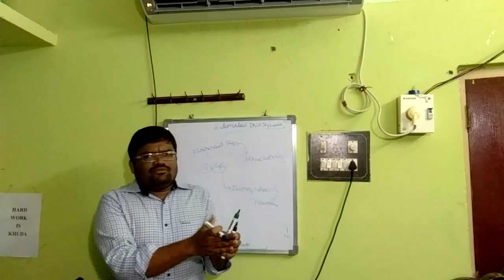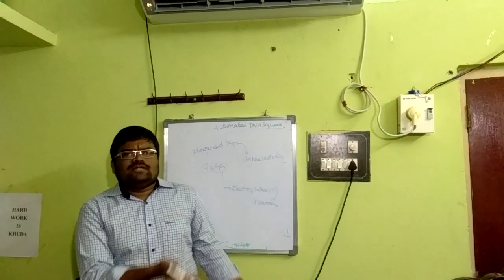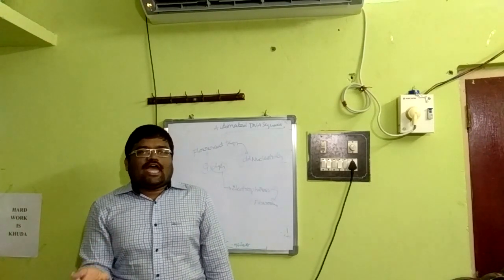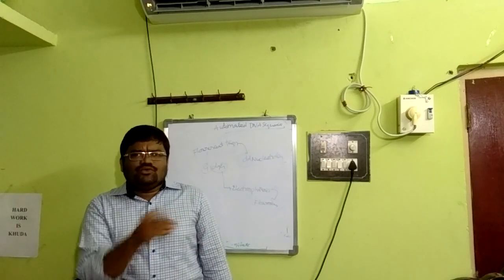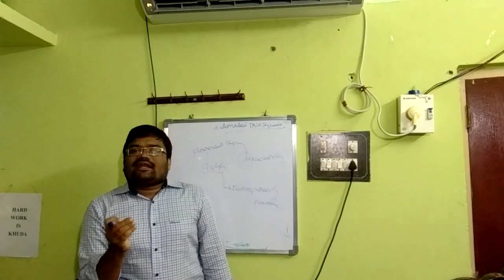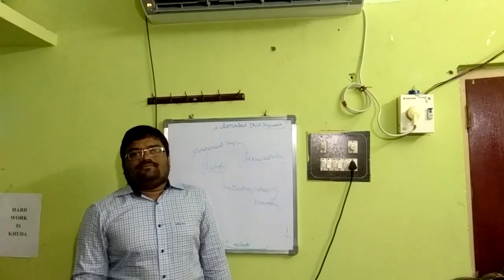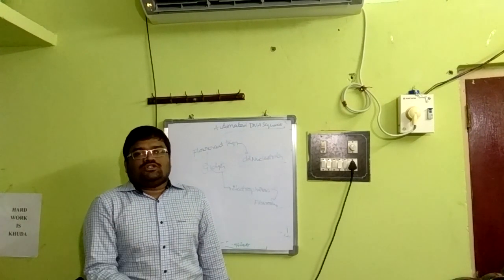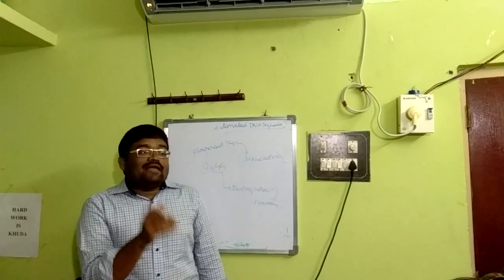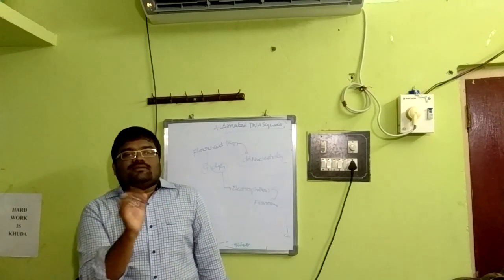After that, the same concept with the help of PAGE. Why do we use PAGE gel? Polyacrylamide gel electrophoresis is much more accurate, even in the dideoxynucleotide method. Why use PAGE compared to agarose? Because it is much more accurate. It can recognize differences among DNAs at the rate of 1 base pair. High resolution compared to agarose. Here the same fluorescence enables us to identify based on the electrophoretic bands.